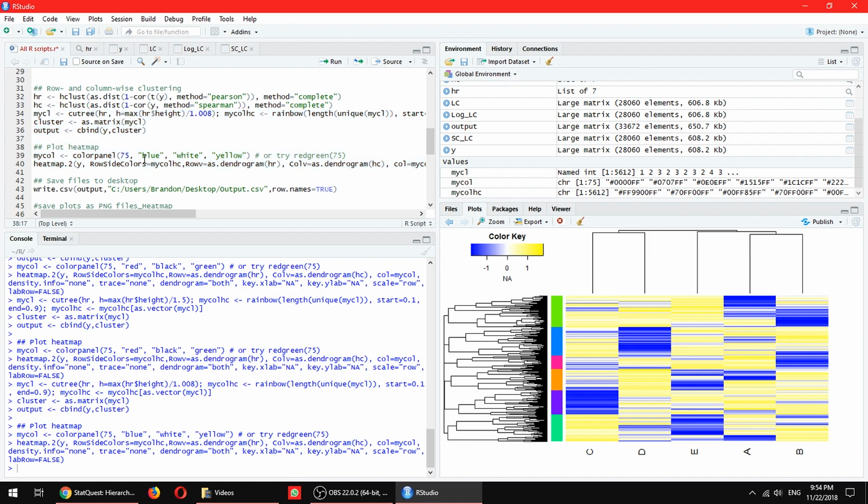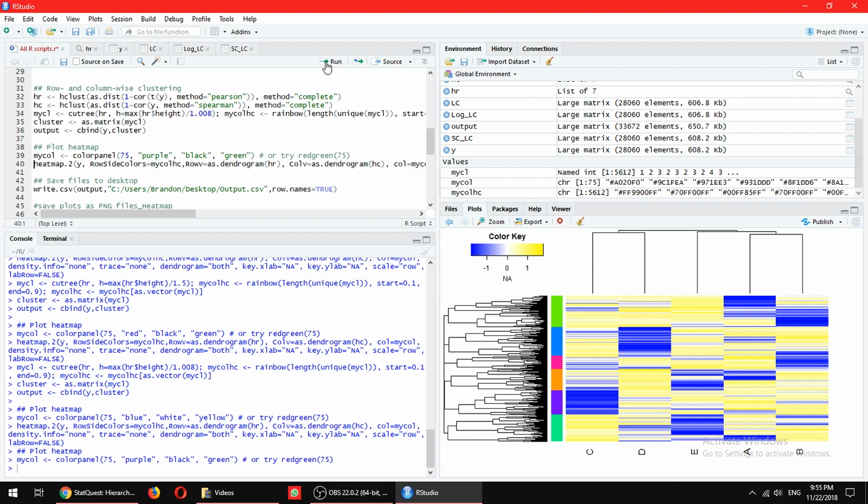Of course, you can change the color. There are a lot of different color palettes in R that you can choose from. You can just put something like purple, or, what else do we have? Green. We already have green just now, but it doesn't matter. Whatever you change is completely up to you. There are also a lot of pre-programmed templates, but I think that's not the important thing we need to do right now.